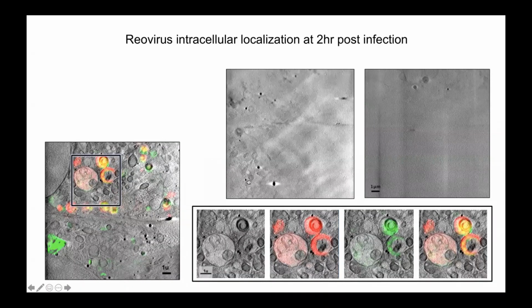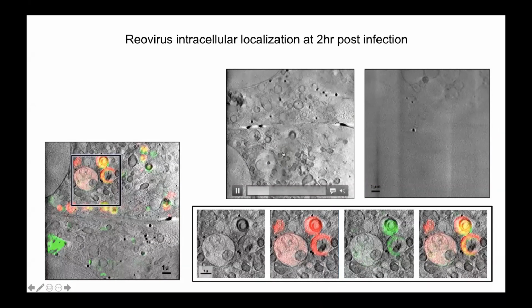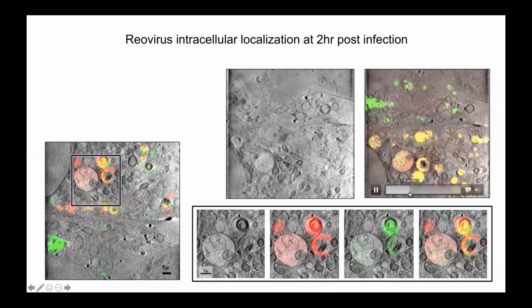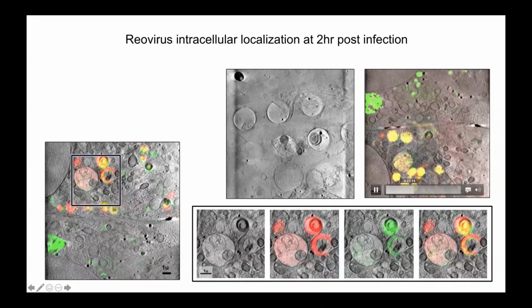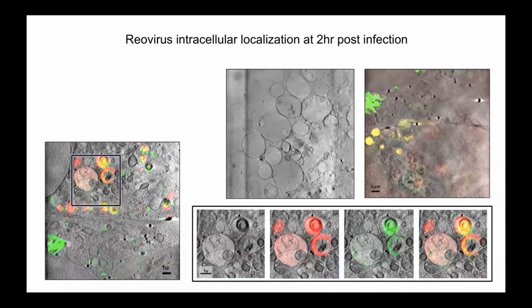And again, the same area, just to show you the comparison. This is just the X-ray by itself. Again, this is the data you've seen already. You're going to be an expert in this data set soon. And then the same thing, but now with all the fluorescence imposed on it, which means to me that I can go and get all my statistics on those specific vesicles so that I can study how the virus travels within the cell.